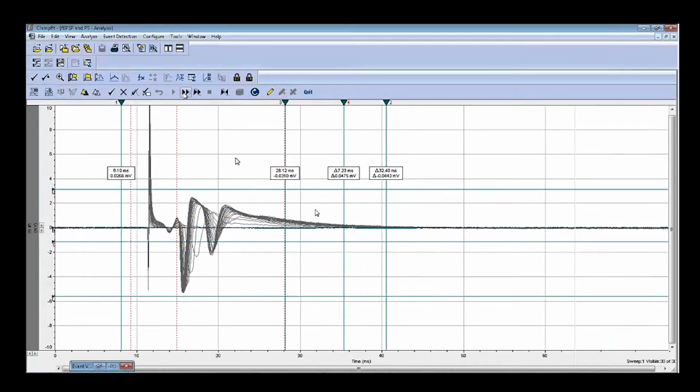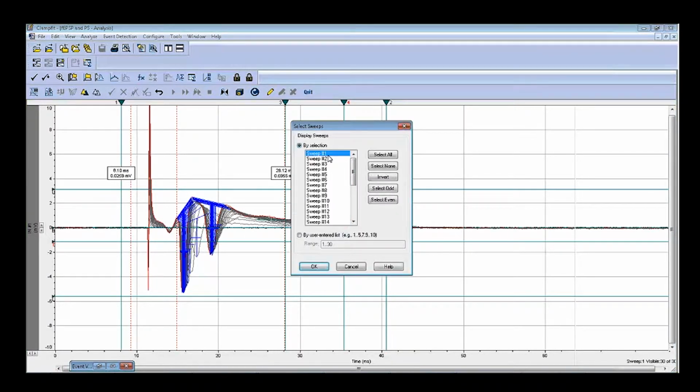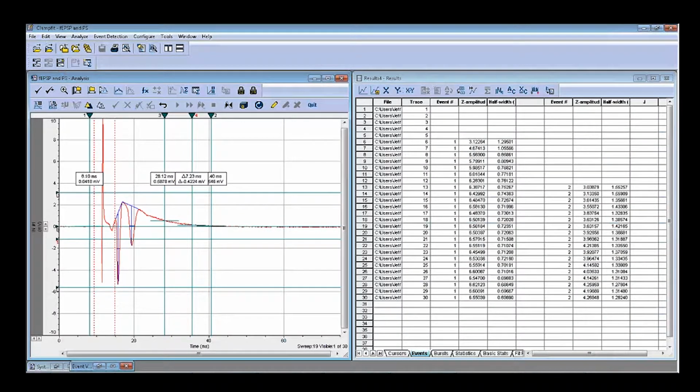Again, you can see only the spikes that cross over the trigger line will be counted, right? So I can share with you. Very beautiful. Now, I also want to share with you that you can modify the data, right?